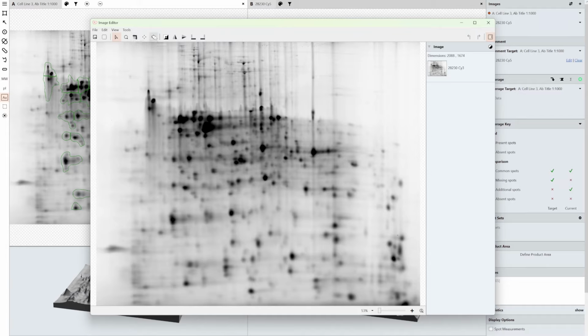So what we've got here is everything that you could expect for image editing within a project. We've got crop, we've got rotates, we've got translates, we've got inversions, we've got flips horizontal, flips left and right. By performing your edits within this image editor, rather than doing it within the image that came off the scanner, we can guarantee that we've preserved the metadata that's within the image. Now, this metadata is things like the wavelength it was scanned at, when it was scanned, the settings that we used on the scanner, the pixel depth, things like that.